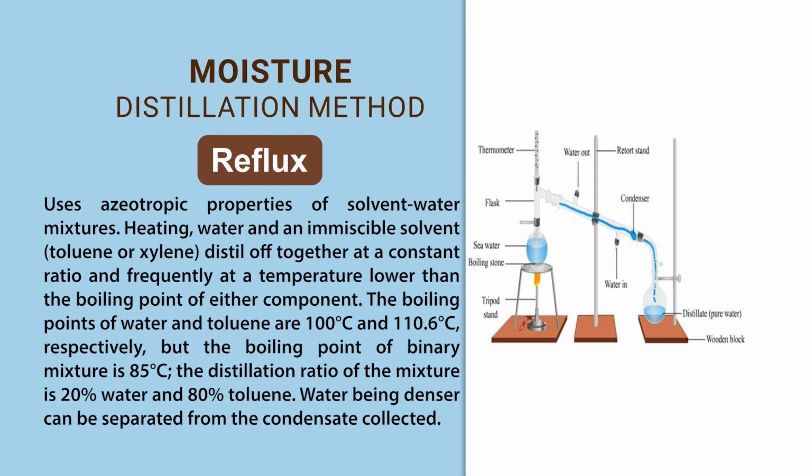That is almost like reflux boiling, where solvent will fall back, and where you are collecting the solvent plus water, because water is heavier, it will settle down, you separate that out, and the solvent again remains there. So this is by way of using non-polar solvent to remove water. This is done for example, all sorts of oils from oil seeds. The extraction is done to remove water. This is the way it is done.